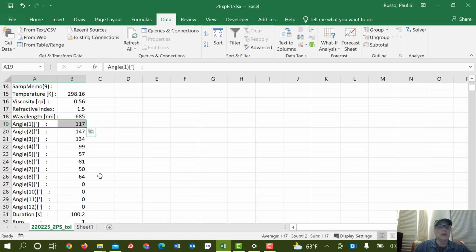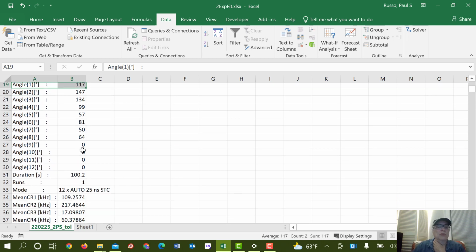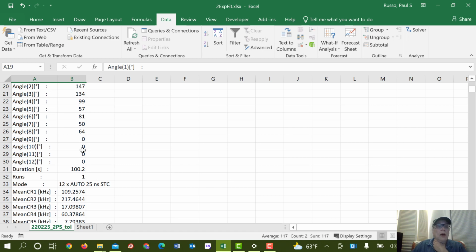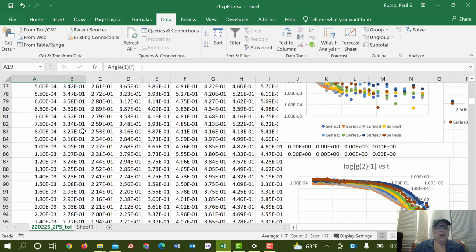Let's try one at the opposite end of the spectrum, this one down here at 50. That's the second from the last one. It's a historical accident that these are not in order, and I don't know what to say about that except that fixing it seems kind of like an ugly problem to us. All right, so that'll be the second to the last one. We'll use that one and see how that one comes out.